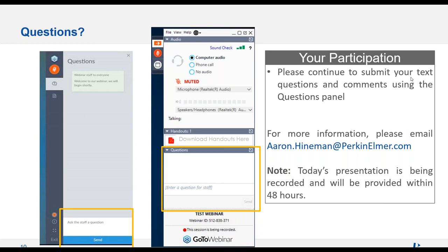I had a quick question here, Zach. With that fractionation you're seeing, have you looked at the effects of different tubing? One thing we hadn't tried. I mean, I thought about that. We try and use the PTFE, but definitely the pump tubing is the Tygon stuff, right? So definitely if we had a slicker tubing, like a Teflon type tubing or Teflon-lined tubing, that might actually be better.